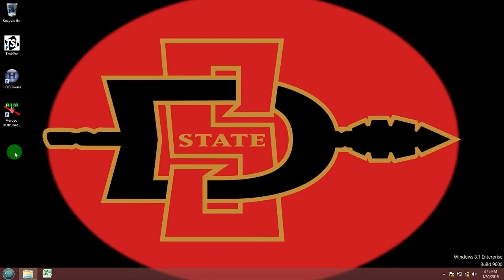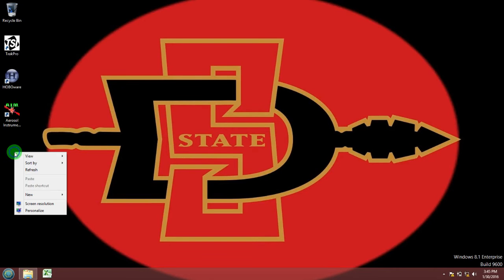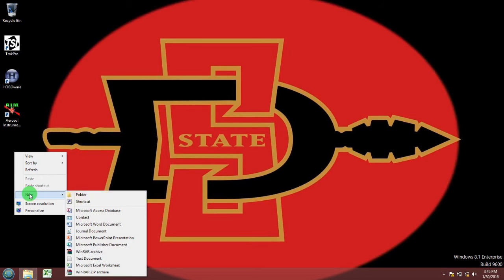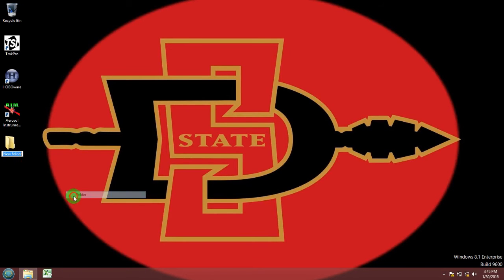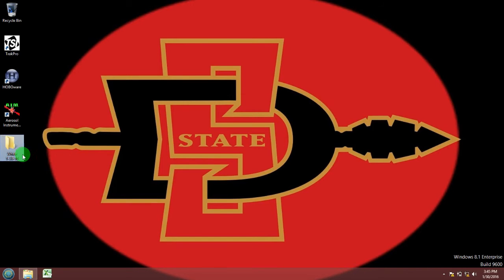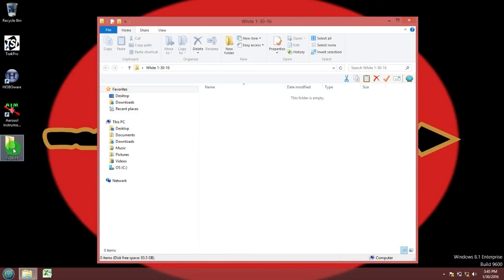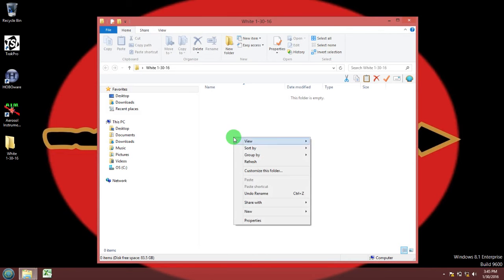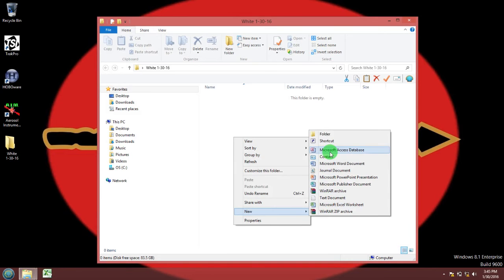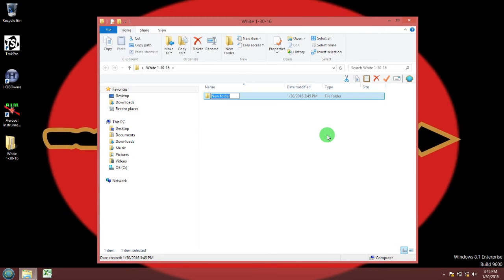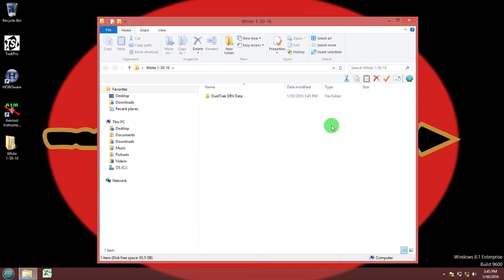Before you download your DustTrack DRX data, for organizational purposes you should first make a folder on your desktop naming it your last name and the date. Inside the folder you should make another folder and label this one DustTrack DRX data. That's where you will be saving your data inside that folder.